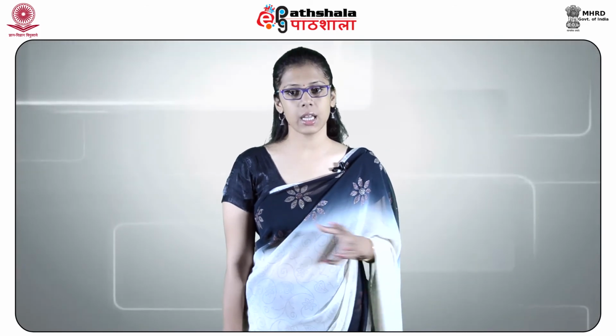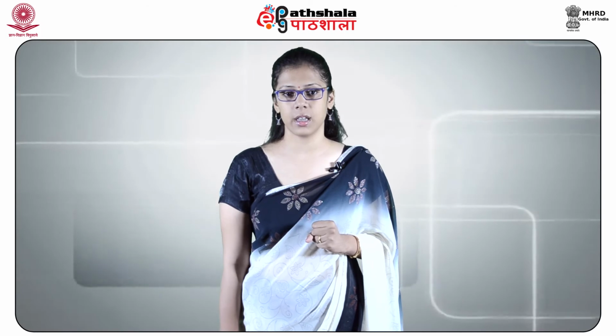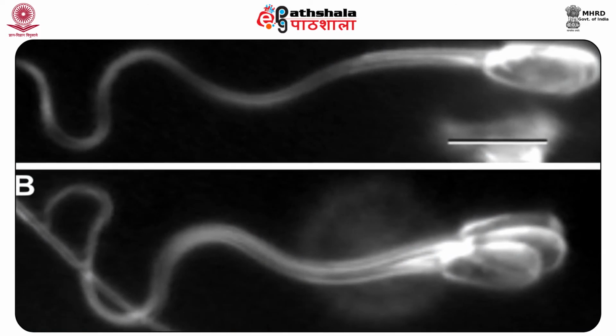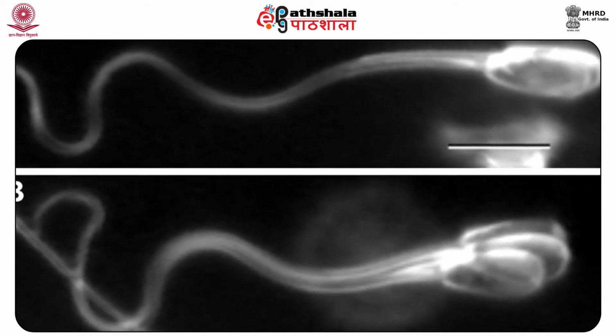Once stained, epithelial cells, that is a group of cells such as skin cells and cells of the lining of body orifices, and spermatozoa have a specific appearance. Microscopically identifying spermatozoa is an absolute indicator that semen is present on an item.